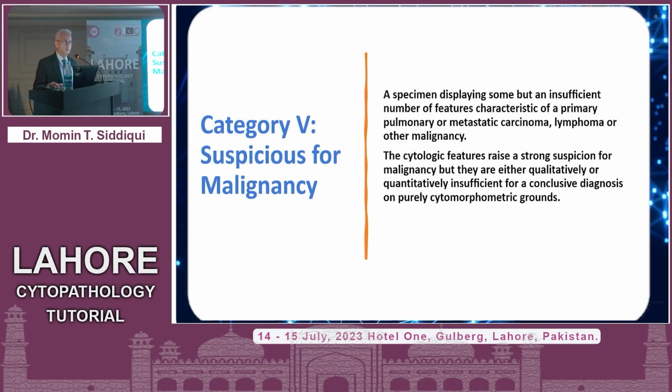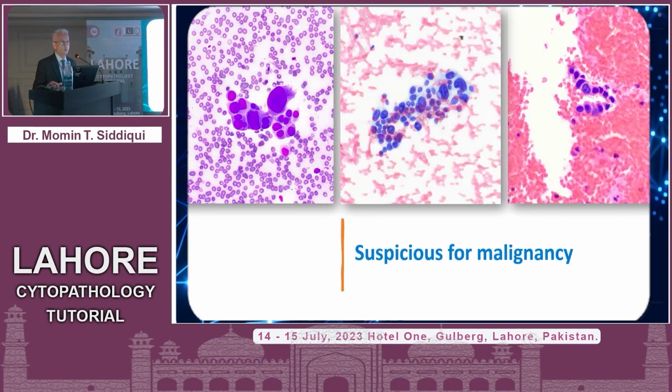And again, just like in the urine, it's both a quantitative and a qualitative question. Based on your clinical information, you are probably dealing with a malignancy, but either the features are not outright there, or a quantitation scenario is in play where there's just not enough for you to make a call. So these are cases which I've had, and I think they are representative of suspicious for malignancy categorization.